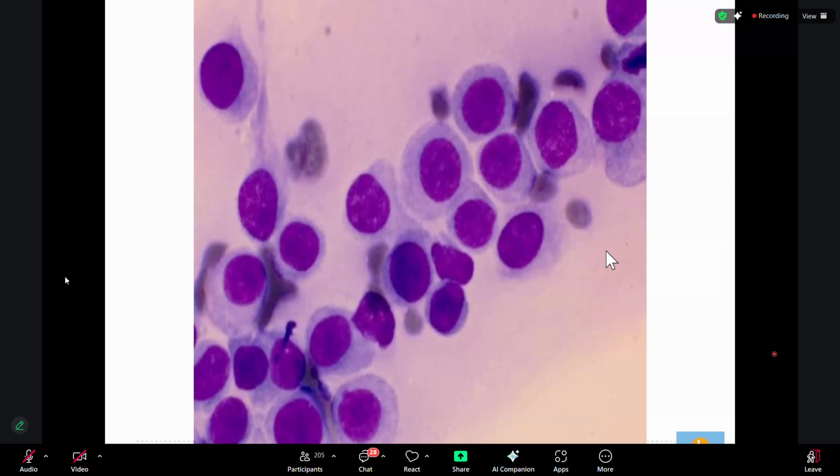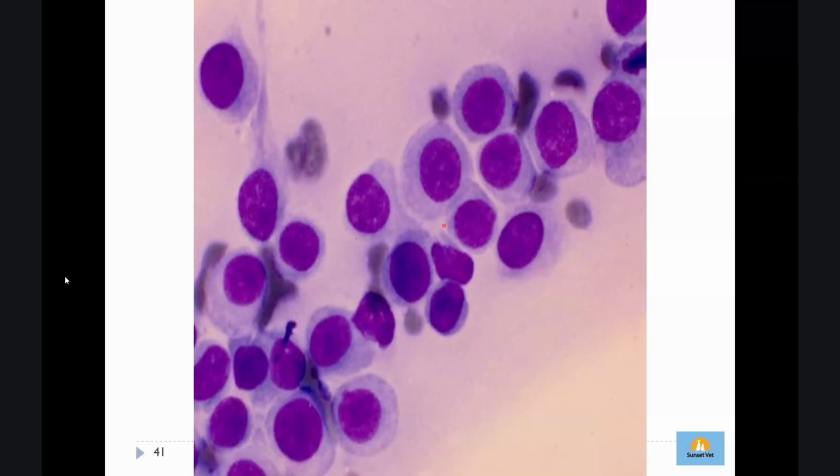Yeah, good. Cancer. And then what cancer? Round, good. And then round, what is the most suitable one for this one? Is there any granules or purple? No, there is not. Okay, there are no granules and purple, so I'm going to delete the mast cell and I'm going to delete the TVT. So it's only histiocytoma, plasmacytoma, and lymphoma.